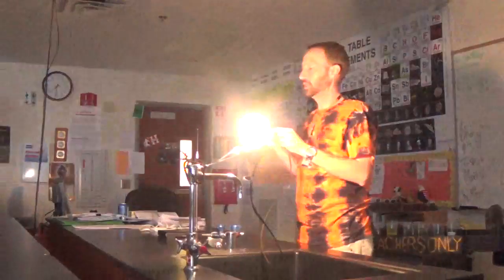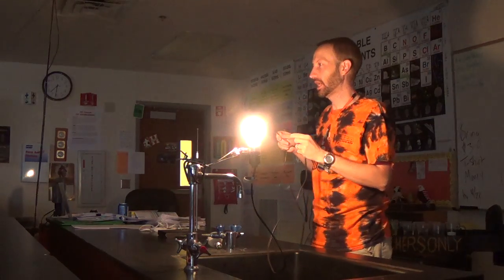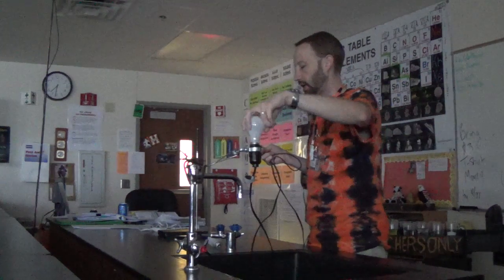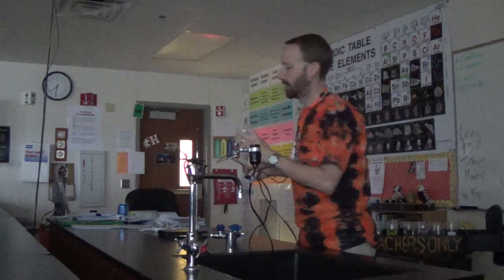And so when I turn it on, and I touch the ends of the wire, the light bulb lights up. So if electricity is able to travel between the wires, we will see that visually as the light bulb lighting up. I also have 2 wattages of light bulb. I have a 34 watt, and I have a 100 watt.